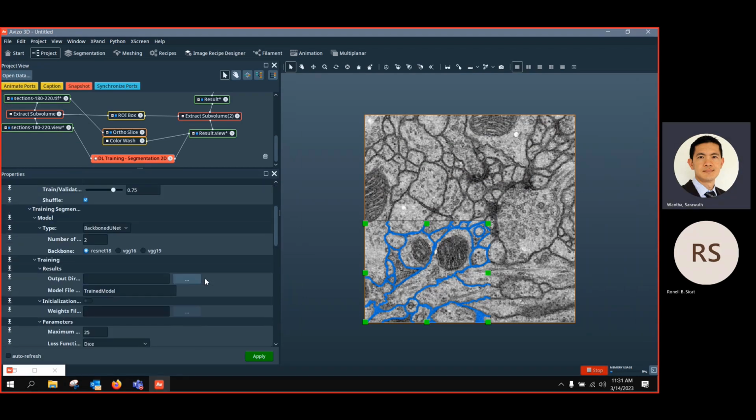And then come to this training segmentation model. So we have U-Net, and we actually have 2 types. We have U-Net and generic U-Net. And the other thing here, we just created to see that we are able to import other models. Like if you want to create your own autoencoder, you create this model and import into Avizo.